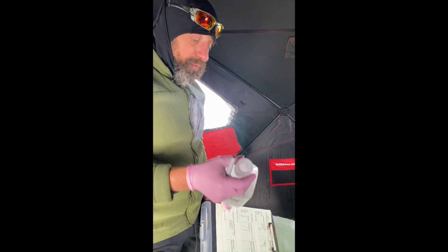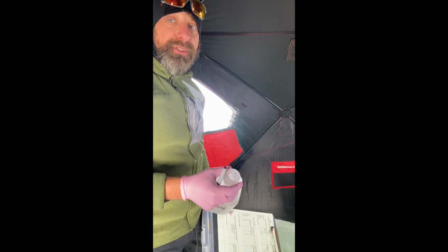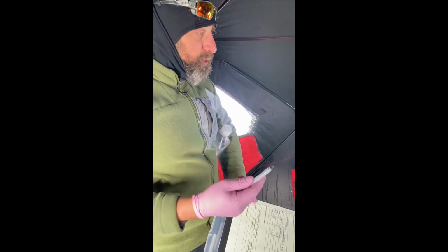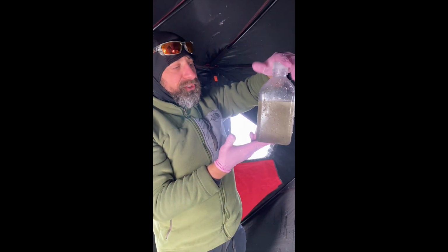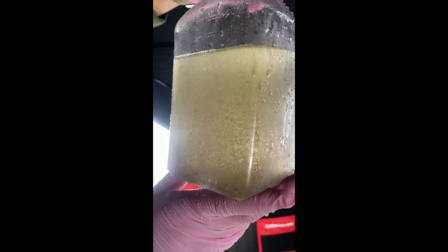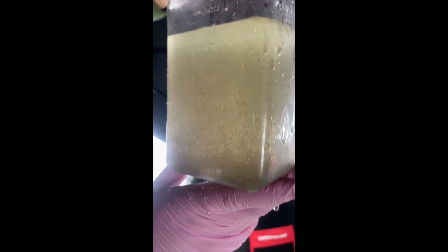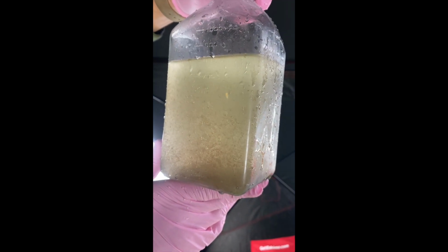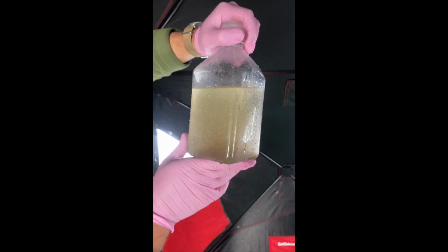So we'll show you what we're aiming for after we've done a couple tows. And you know, in some lakes we have to do like 10 tows. In this lake it's probably going to be maybe 2 or 3 tows for each duplicate to get a really large sample. So we'll show you in a few minutes what we've gotten. Okay, so this is 3 tows. Again, we're not trying to be super quantitative. The goal is to get a whole bunch of zooplankton biomass that we can use for analysis later. You probably don't need quite as much. You could probably get away with about half this density, but make sure you have a dense sample.